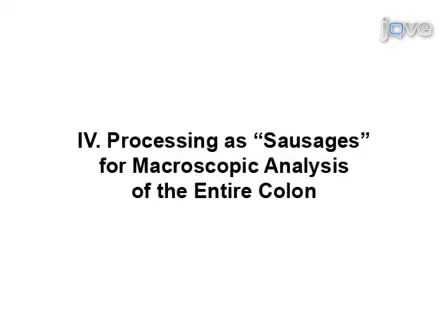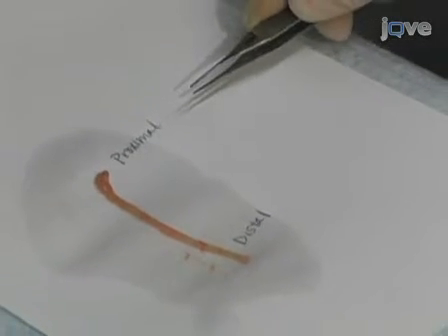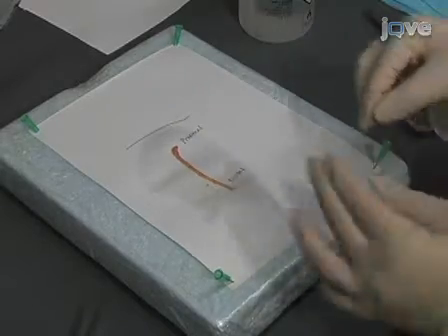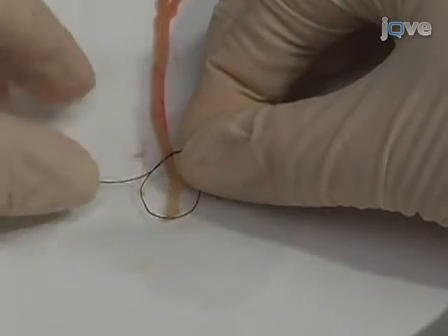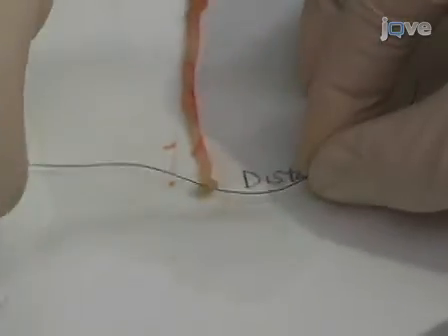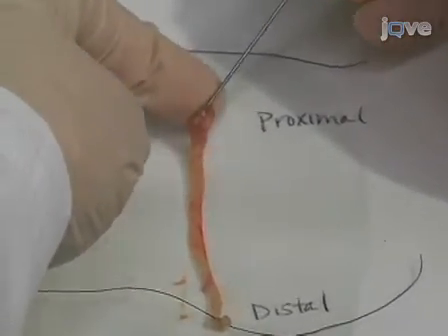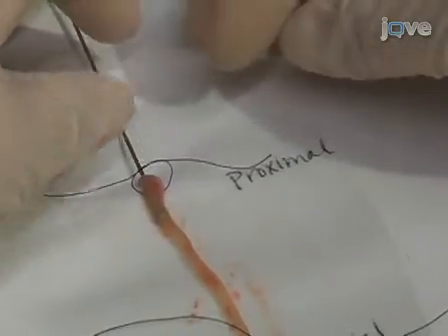To process the colon as a sausage for macroscopic analysis of the entire colon, it is important to maintain the correct orientation, keeping the distal end of the colon closest to you. Cut two pieces of non-absorbable suture, one approximately one inch in length and the other two inches in length. Use the two inch piece of suture to tie off the distal end of the colon as close to the margin as possible while still maintaining a good seal. Then place a 20 gauge feeding needle containing 5 milliliters of 10% buffered formalin phosphate into the proximal end of the colon. Loosely tie the remaining piece of suture immediately proximal to the bulb of the feeding needle.